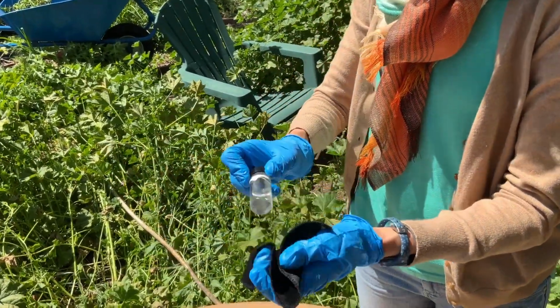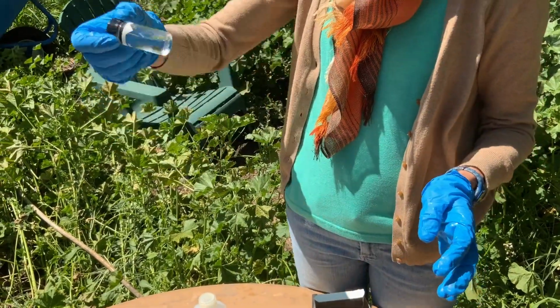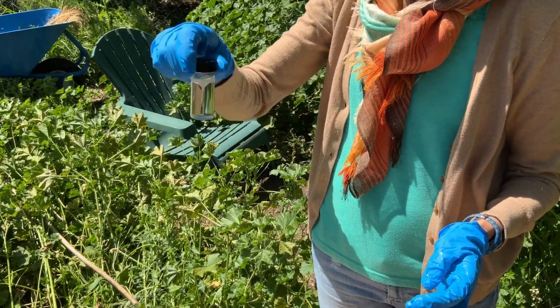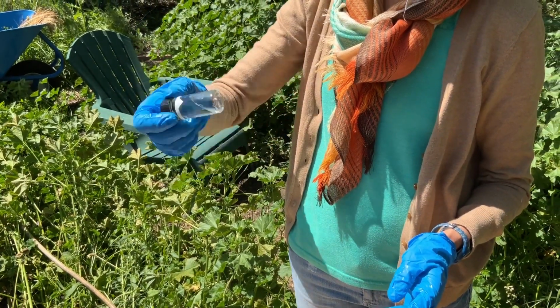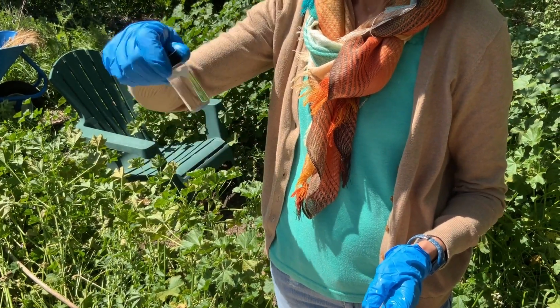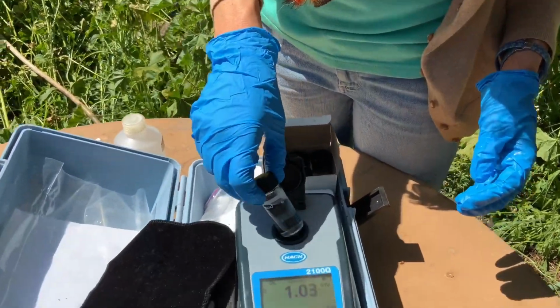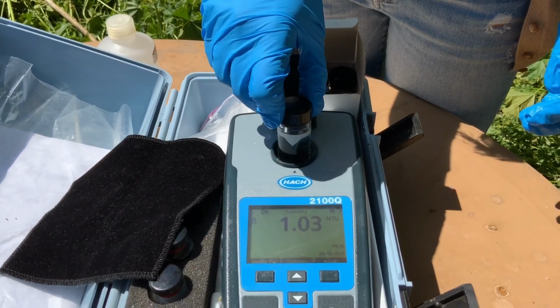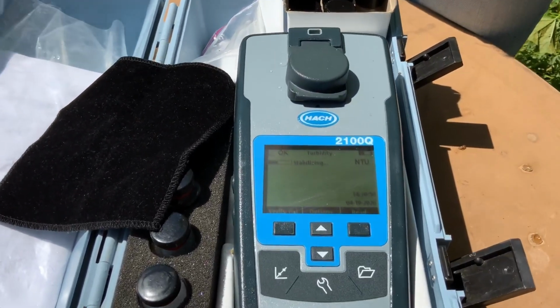So I don't need to oil it again. Probably good with the oil, but I do need to do the inverting. 2, 3, 4, 5, 6, 7, 8, 9, 10. And I do have a couple air bubbles, but they're right up near the top, so I don't think they should be a problem. But that one might be. Okay. I'm gonna stick it in there and press read again. Let's see what we get.